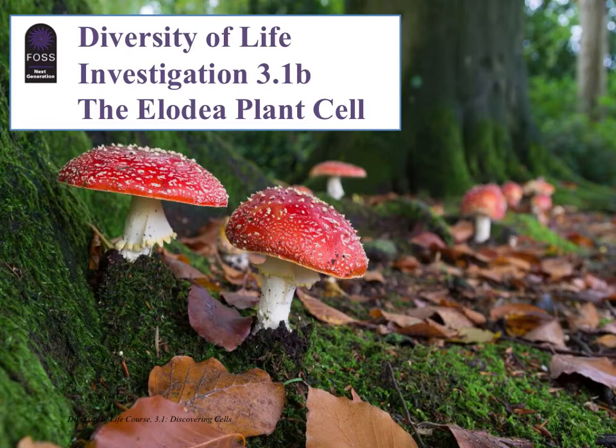Diversity of Life, Investigation 3.1b, the Elodea plant cell. Last time we were looking at the Elodea plant, that aquatic plant that you'd find in some aquariums and stuff like that, and we looked at it through the microscope at very high power to see what microscopic structures that Elodea plant was made up of.